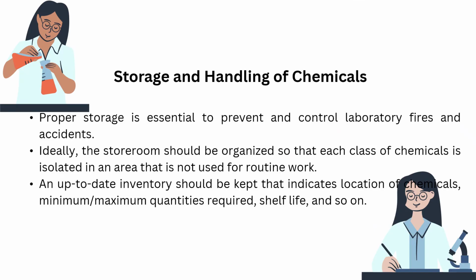To avoid accidents when handling chemicals, it is important to develop respect for all chemicals and to have a complete knowledge of their properties. This is particularly important when transporting, dispensing, or using chemicals that, when in contact with certain other chemicals, could result in the formation of substances that are very toxic, and can also be flammable or explosive.